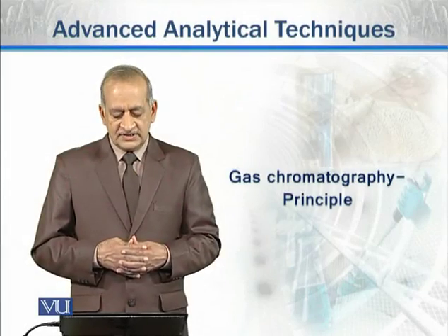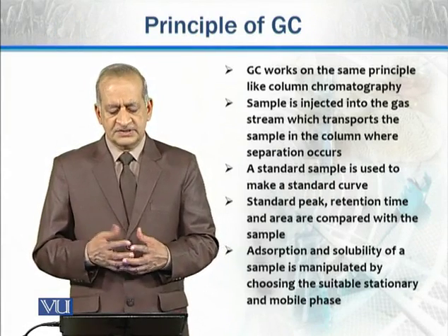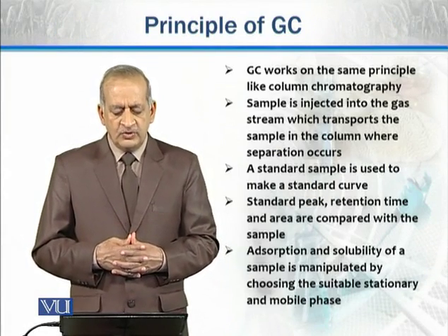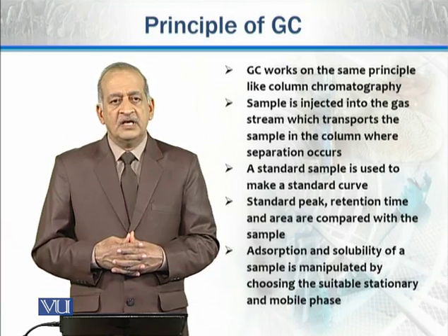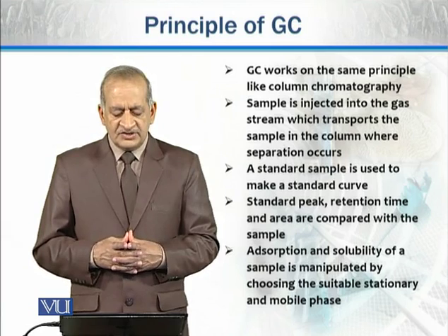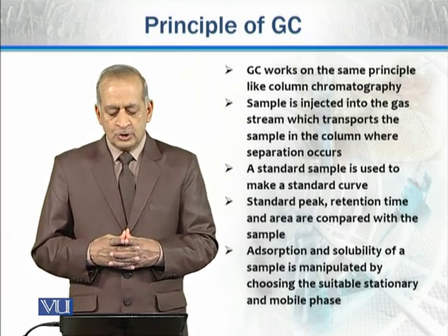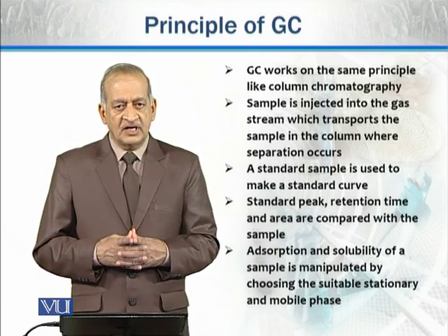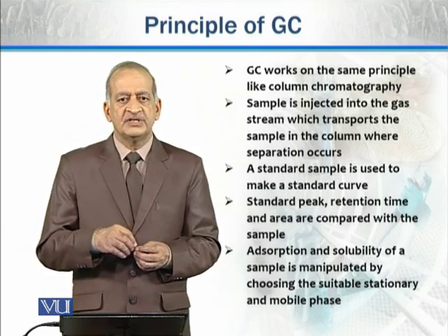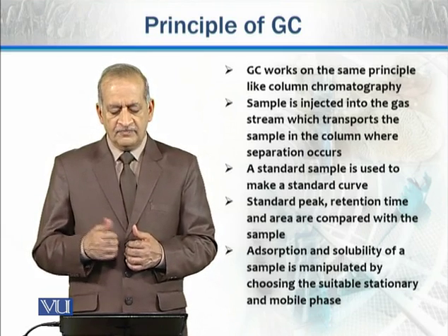Now we will discuss the principle of gas chromatography. So we'll see how it works. Gas chromatography works on the same principle as column chromatography. The sample is injected into the gas stream, which transports the sample into the column where separation occurs, as components of a mixture react with the stationary phase of the column.